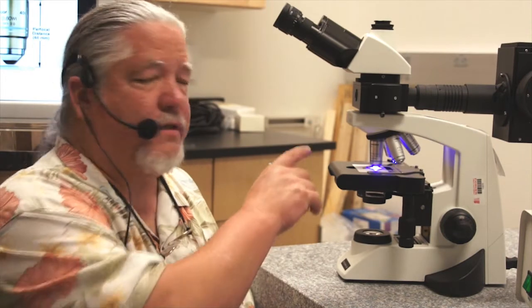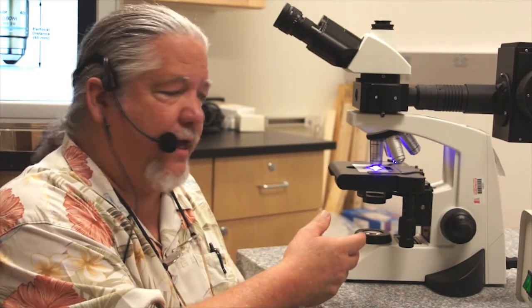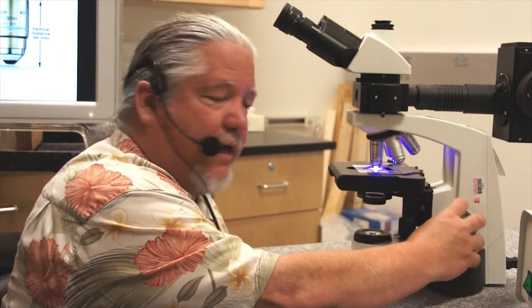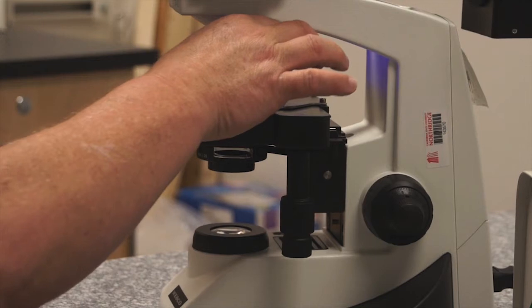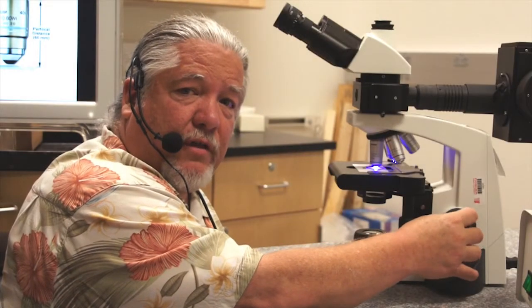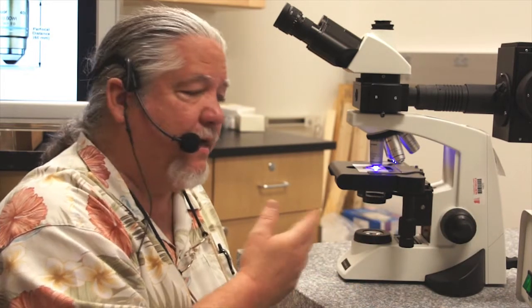Another important concept on the microscope is par-focality. When you're looking through a 10x objective and you're in focus and want to go to another magnification, it's not necessary to lower the stage. You can be in focus at 10x and go to 20x or 40x and be within a half turn of the fine focus. This is called par-focality and is available on most modern microscopes.